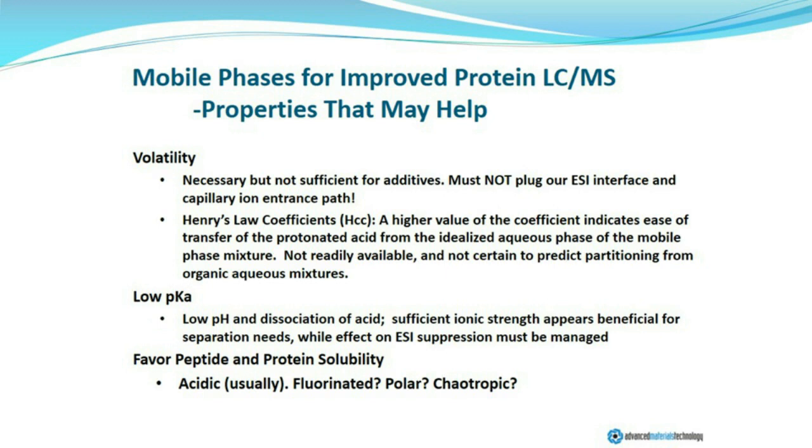And that list of potentially useful or required characteristics is shown on this slide. Now, first and foremost is, of course, you must have a volatile component.